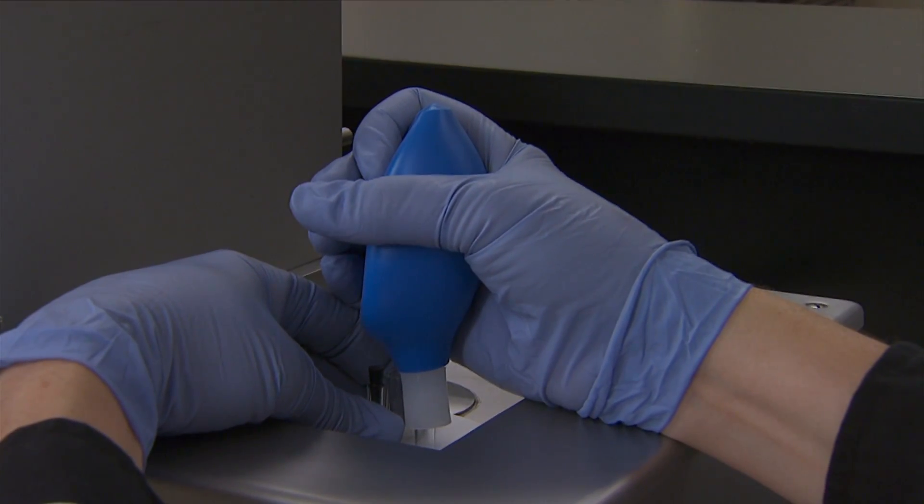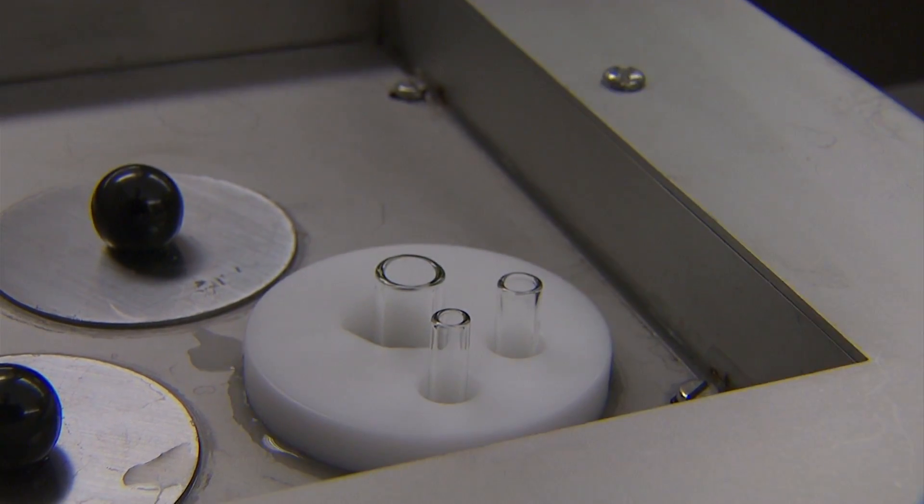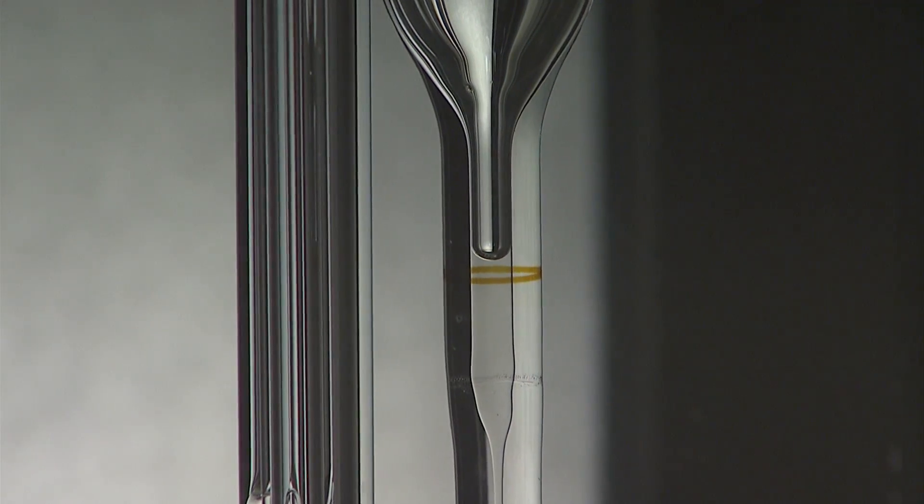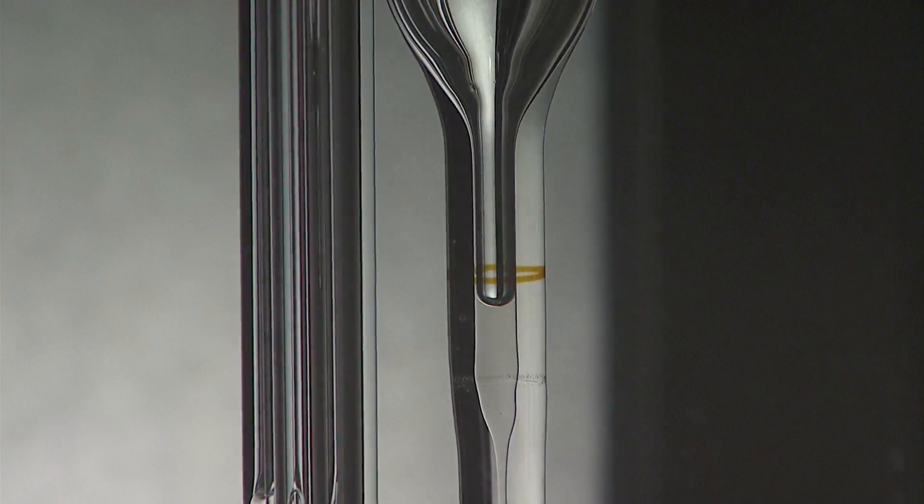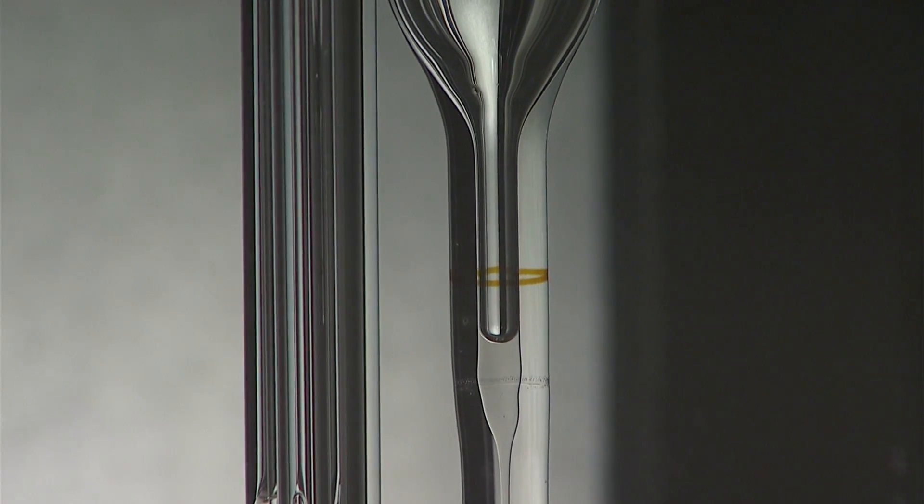Kinematic viscosity of a fluid is a property that indicates the fluid resistance to flow. Kinematic viscosity is determined by measuring the time for a volume of liquid to flow under gravity through a calibrated glass capillary viscometer.